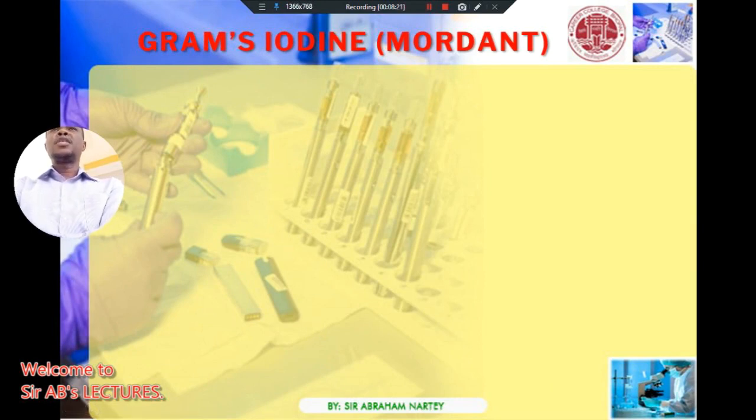So next we want to look at how to prepare the Gram iodine mordant. When we say mordant, I have explained to you already that the main function of the mordant in the staining process is that it will fix the primary dye. If it was really absorbed by the microbe, it will fix it to remain in the microbe. So after your decolorization, this color will still not go. But if it was not absorbed, the mordant cannot fix it, so after you decolorize, it will wash it away. That is the main purpose of the mordant.